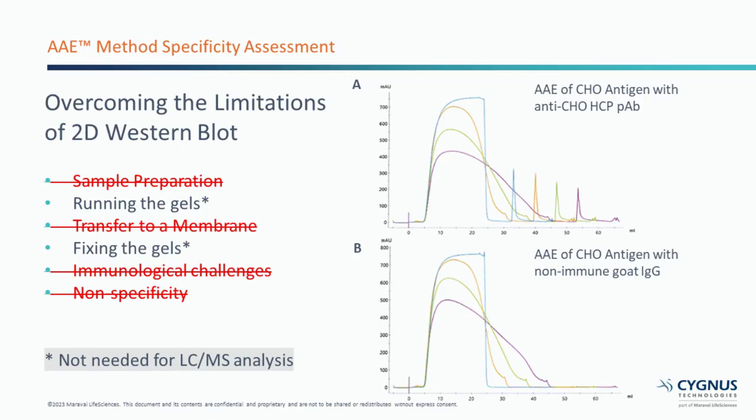Gel transfer to PVDF membrane can also dramatically affect results. Too long or too short transfer times will impact the membrane penetration of high and low molecular weight proteins, leading to misrepresentation of immunoreactive proteins. PVDF membranes can also hide the binding epitopes of ELISA antibodies, and they can also trap secondary antibodies, leading to large non-specific spots. Lastly, exposure time of chemiluminescent or fluorescent signal influences final Western blot results.